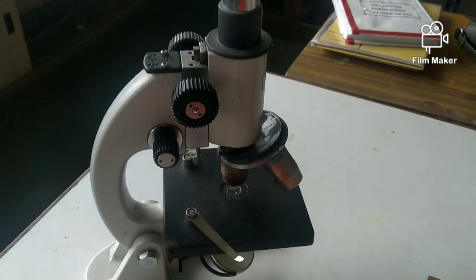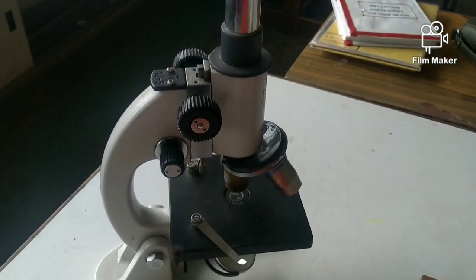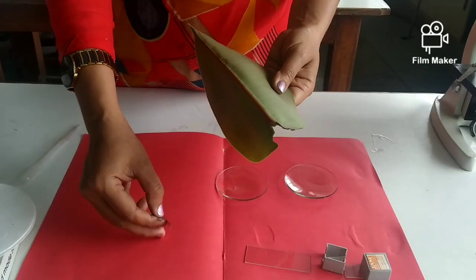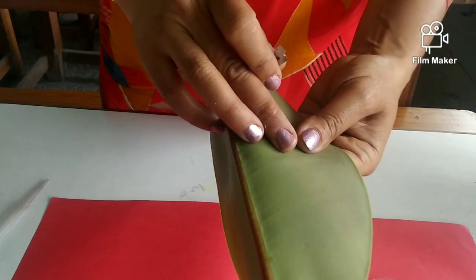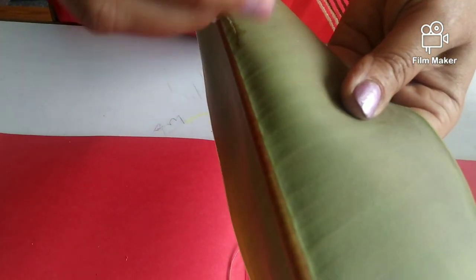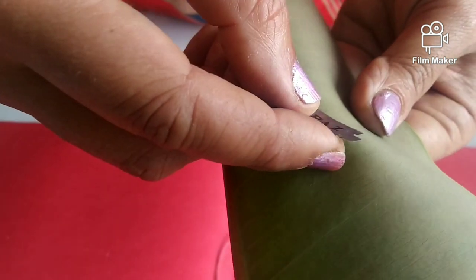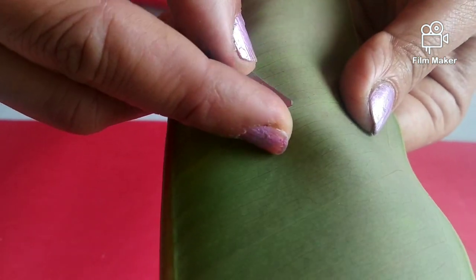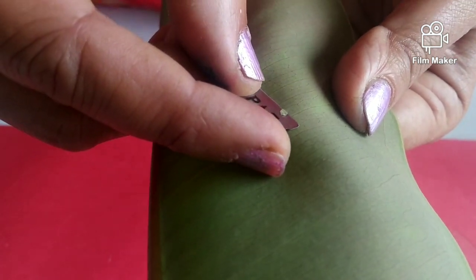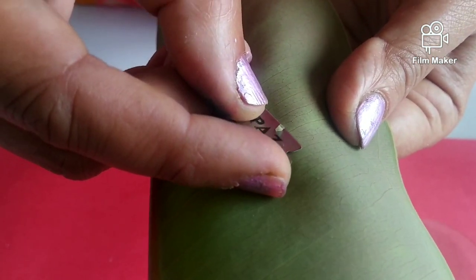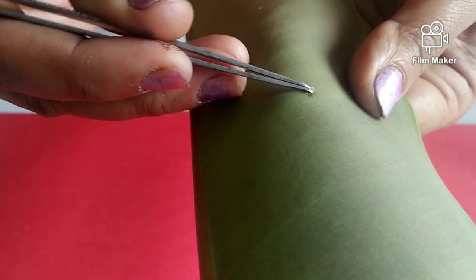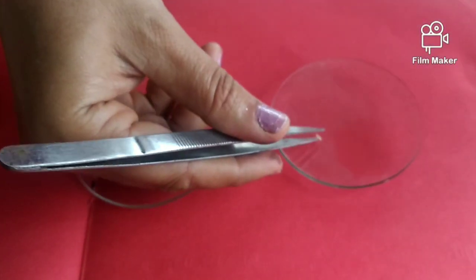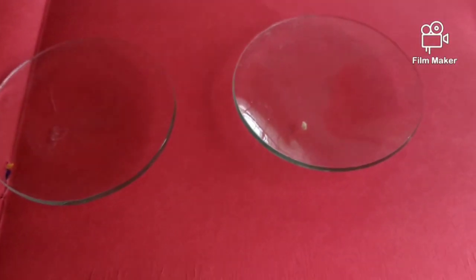Now the first step is to take out the epidermal peel from the lower epidermis of the leaf with the help of a sharp blade. The piece of epidermis is transparent. It should be a very thin layer. Now place it in the watch glass.